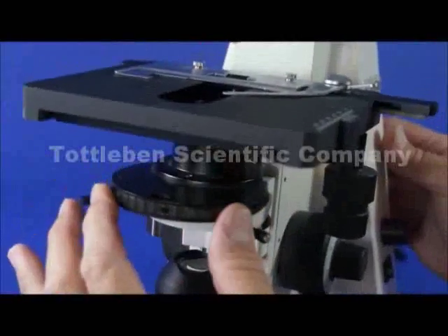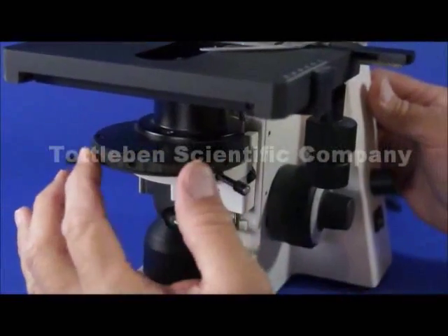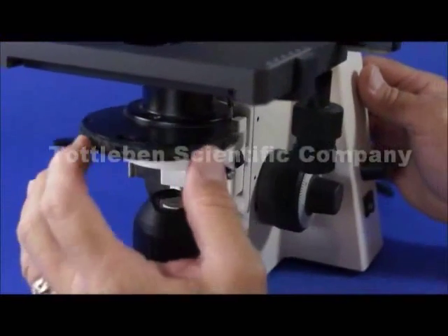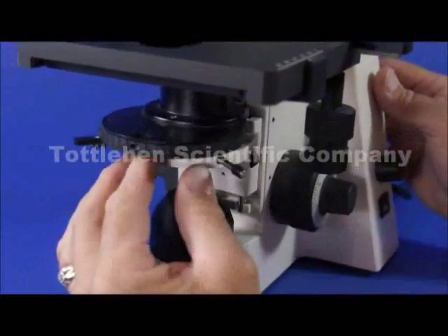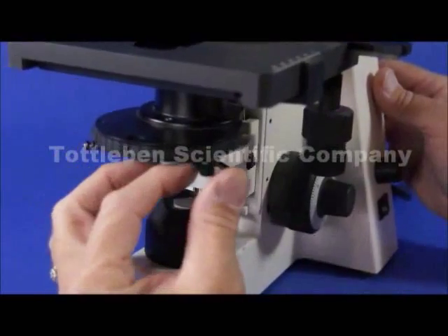It has phase positions for one, two and three. A bright field position with an iris diaphragm for stopping down the field and accentuating your resolution. And also a position for dark field.